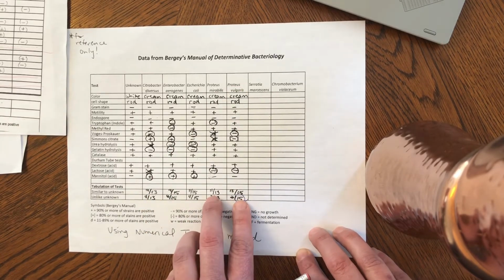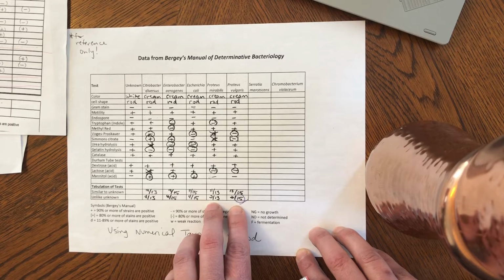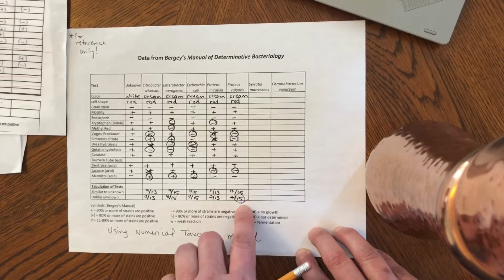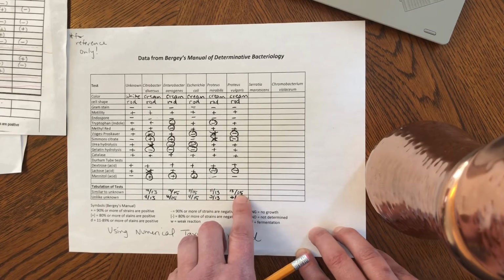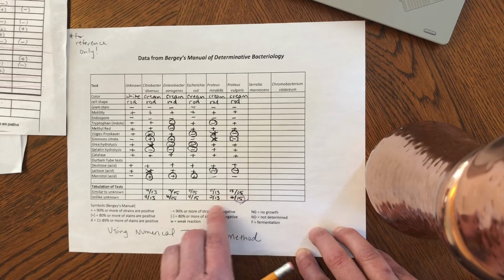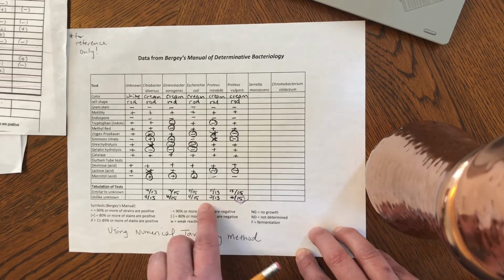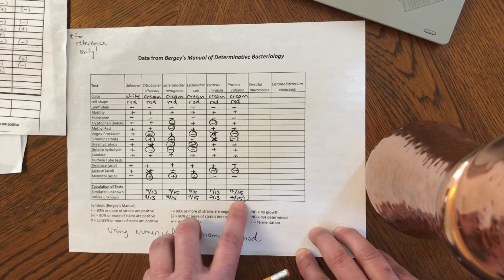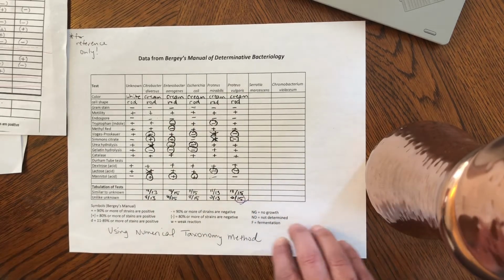But if you look at this, look at these ratios. 11 out of 13 and 13 out of 15 are basically the same ratio. There's 2 unlike in both of these scenarios. But I would still go for Proteus vulgaris because Proteus vulgaris has more test results that I can compare my unknown to. So even though 2 out of 13 and 2 out of 15 kind of seem to be the same because that's the unlike unknown, 15 tests is better to compare with than 13 tests. So I would say that Proteus vulgaris is my bacteria.